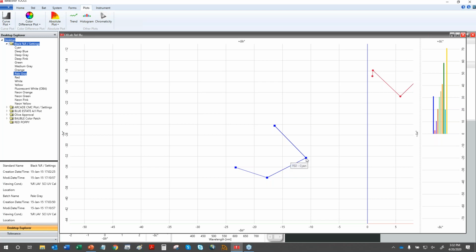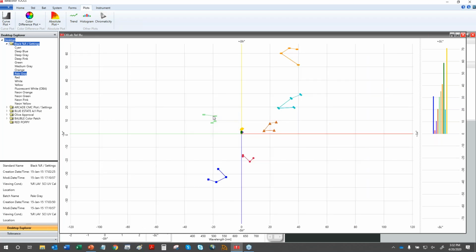So if I were to evaluate cyan in fluorescent and then look at that in LED, I would find that there's a significant shift. And I can qualitatively make this assessment for all of my samples just by looking at the shapes of the lines. For the orange, again, we see that D65, F02, if I move up, here's LED and incandescent A. So there is some difference between fluorescent and LED, perhaps not as significant as it was for the cyan.